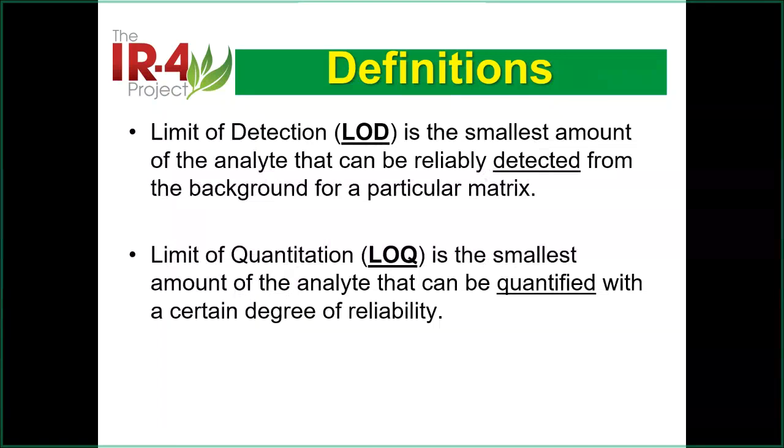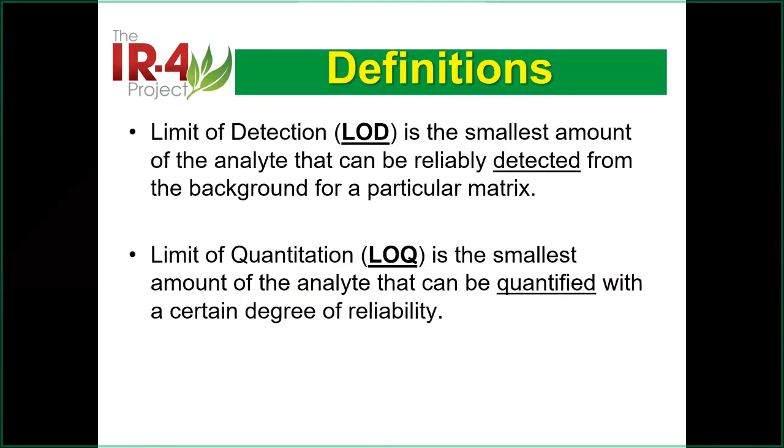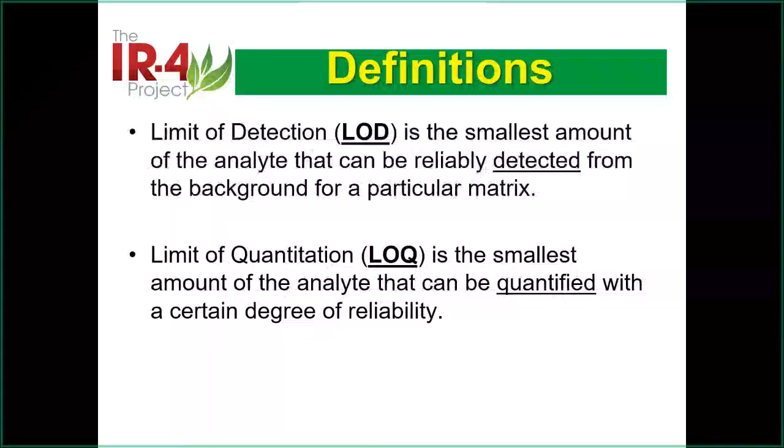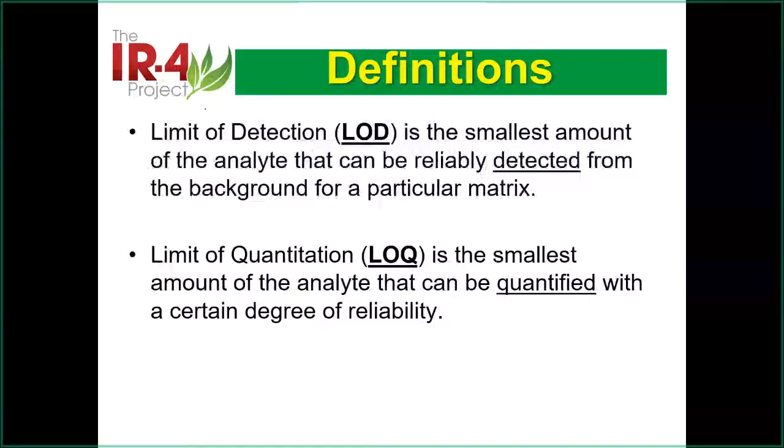We spent about 10 or 15 minutes going through, which is a good overview. So we are going to talk about the lab. When we talk about the lab, the first thing is the detection limit. When you analyze something, you're going to report your number. This is the science term, LOD, LOQ, and how you calculate that, how you get this number. This is science. This is not GLP.